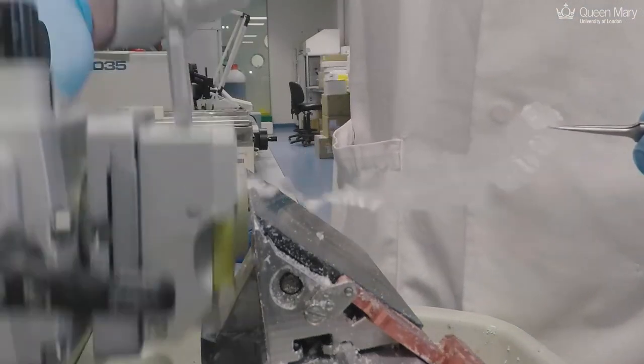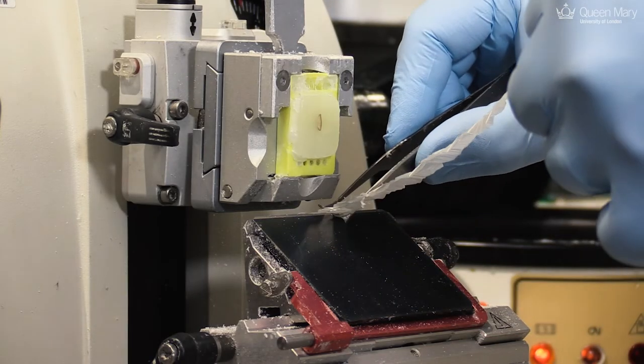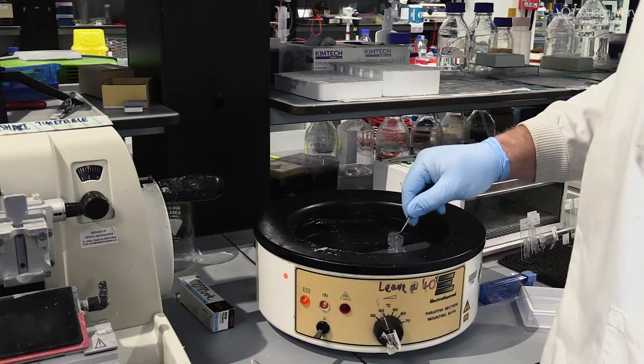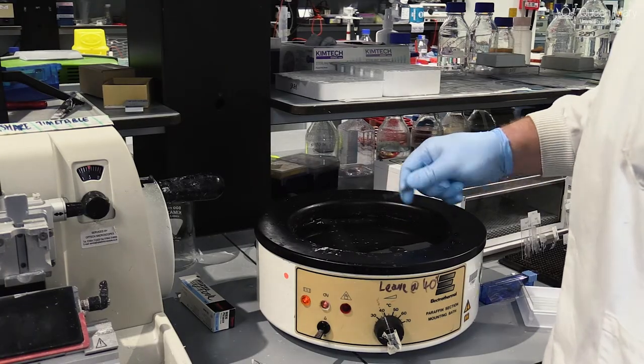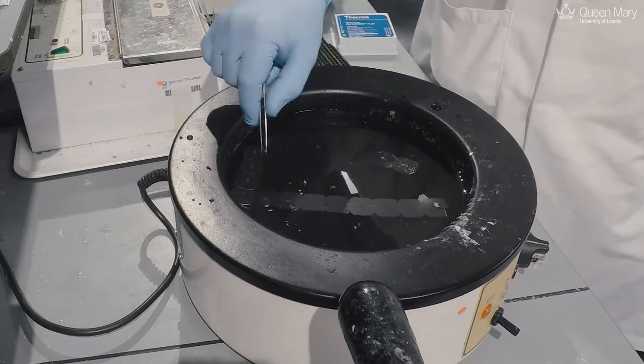So each one of these slices is 5 microns thick. We can then take them and float them on a warm water bath. This allows them to relax, to spread out, and allows us to mount them to microscope slides.